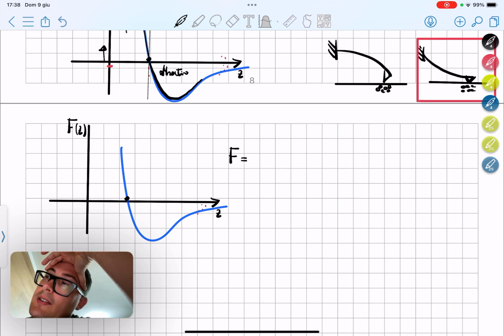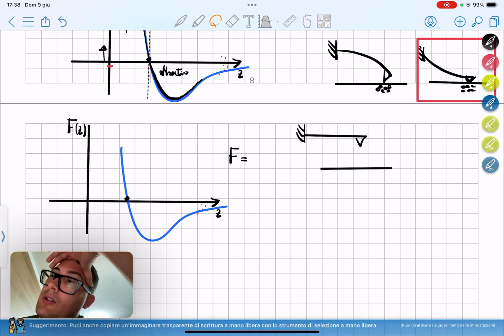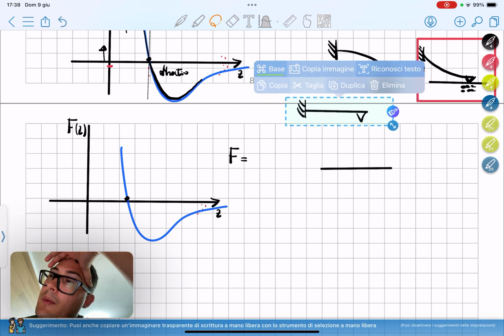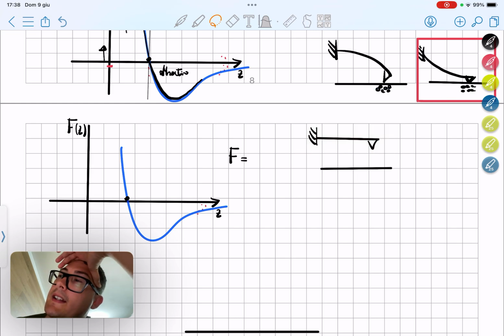One aspect is that imagine that we are approaching our sample with a cantilever. This is always sketching the sample, even if it's not flat, remember that. And the cantilever is going down from a position above. We can think of this in this plot as going from this point maybe into here, okay?